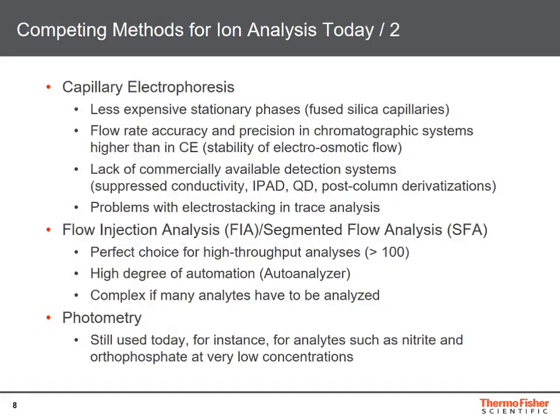The list can be continued with capillary electrophoresis. Some 15 years ago, there was a lot of hype about this particular analytical technique because the speed of analysis was so much higher as compared to normal ion chromatography. The stationary phases in the form of fused capillaries were very inexpensive, and the whole system setup on first view seemed to be very simple.